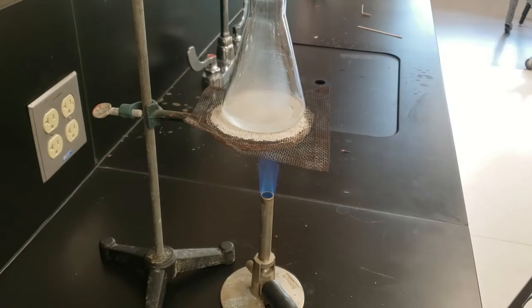So you should monitor this so that you don't end up boiling off the liquid too quickly. You want to leave a few milliliters of water in the bottom. Otherwise, you're going to wind up with a bit of a residue that's difficult to clean up. So let this thing go for a bit and keep your eye on it just so you don't boil off all the liquid.